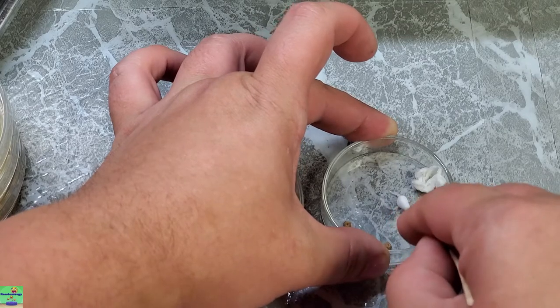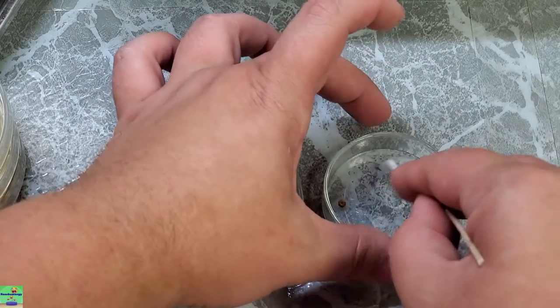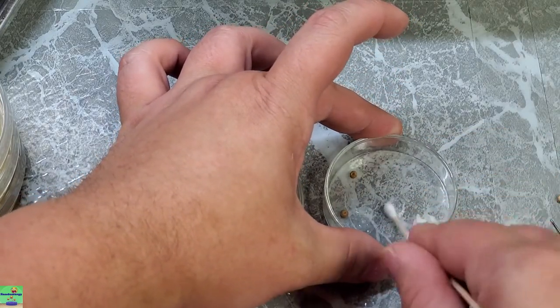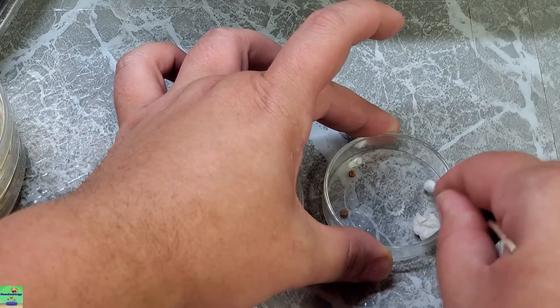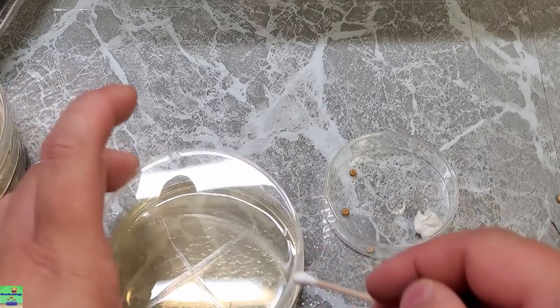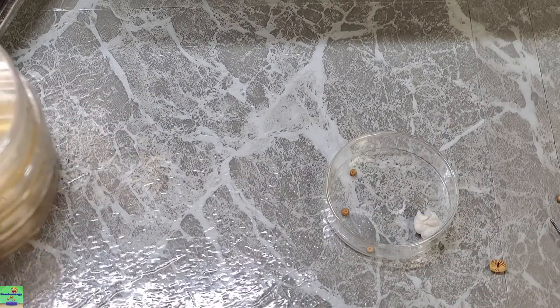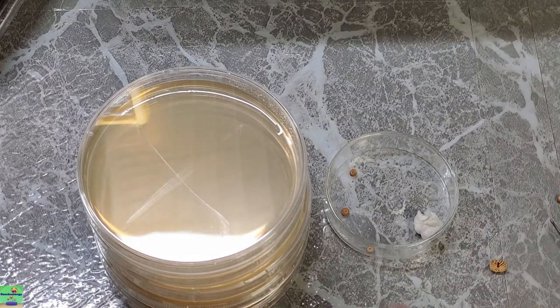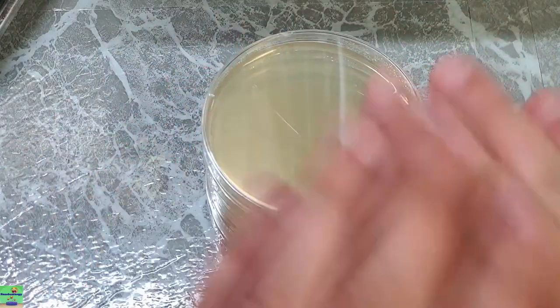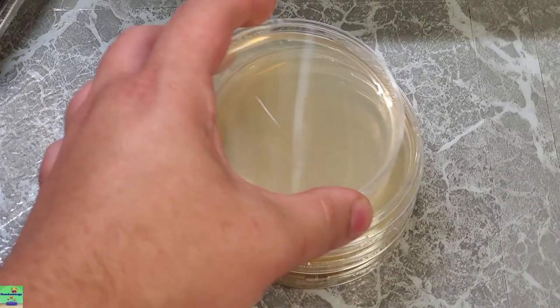And we're just going to do that. This can be kind of like a free-for-all right here. I'm just gonna rub these all over the tip of this applicator. Okay. I'm just gonna put a big X right here. Good. Now that's all of those. I can set this off to the side. Don't need these little guys anymore, so I'm just gonna flick them off into the garbage. Move that over, and now all you gotta do is label these.